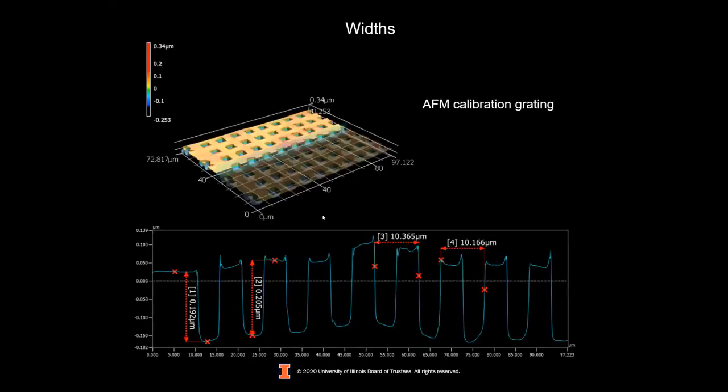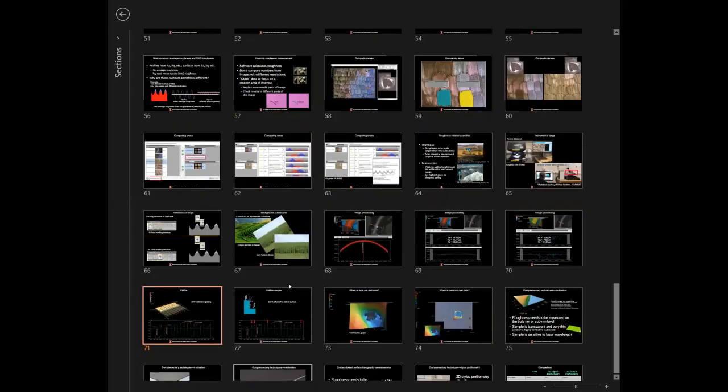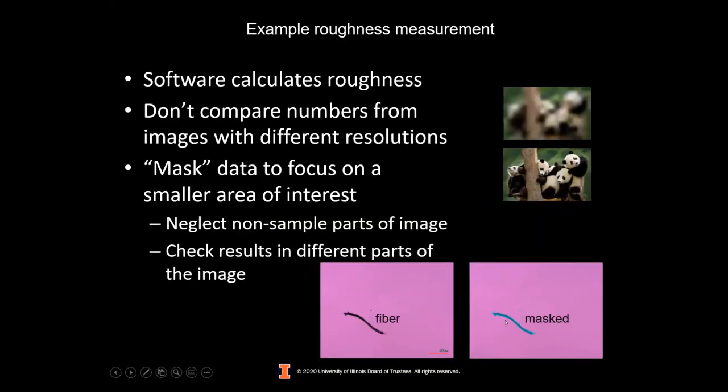Okay, you got it. So if you want to exclude these particular areas, then you should choose a mask to go over top of those specific areas.